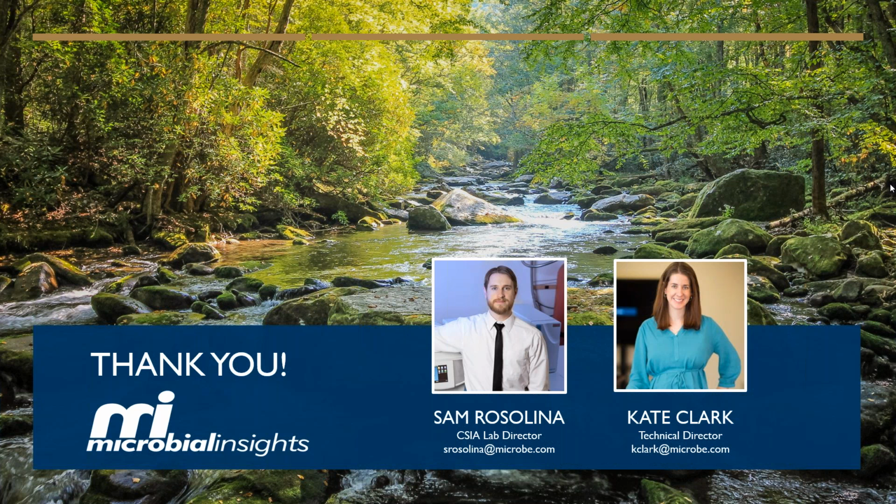So, Sam, one of the questions that we have, it's specifically for you, it's talking about CSIA, and it says, does the delta value increase with abiotic degradation too? So I think it might be good if you can talk a little bit about how we can differentiate biotic from abiotic degradation.